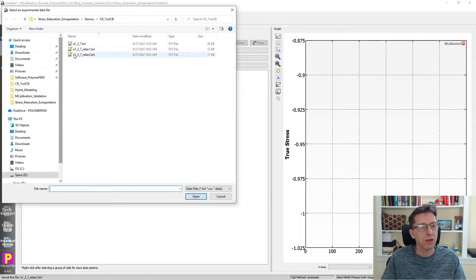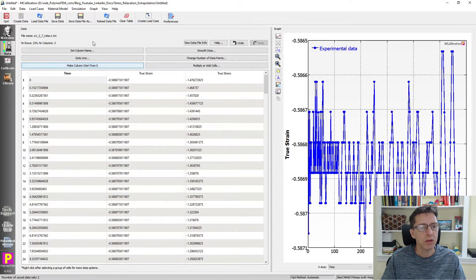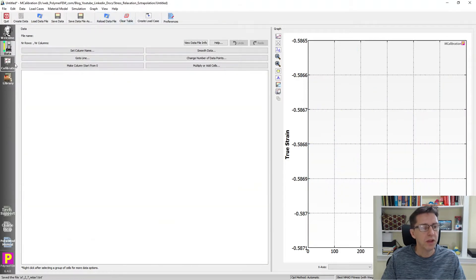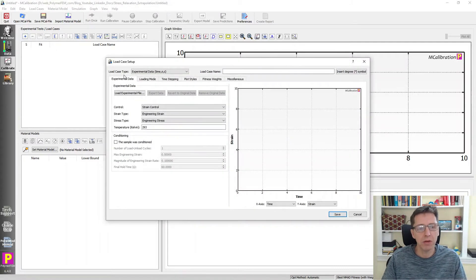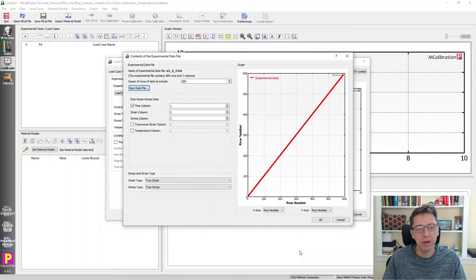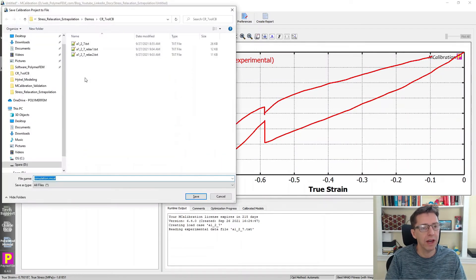I'll load in the first file we created just to double check the time — this one should start from zero as well, so I'll fix that. This is relax1; I'm going to replace it. Back in the main window of MCalibration, I select Calibrate. I'm going to read in these files to look at them and work with the relaxation data. First, I'll read in the original file — experimental time, stress, and strain. I save it, and here it is: Demo chloroprene rubber.